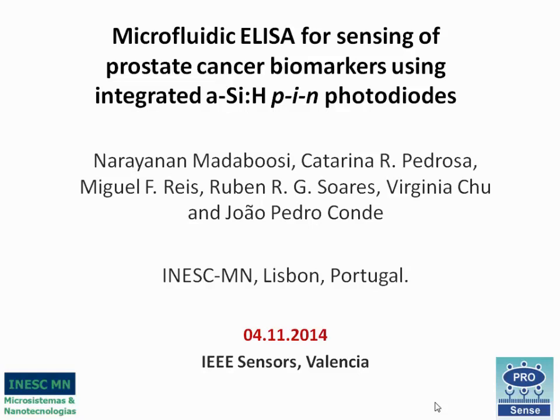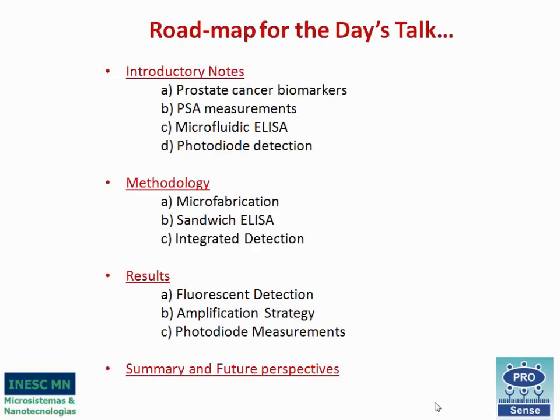I am Narayanan from INESC-MN Portugal, and I am glad to present the paper on microfluidic ELISA for sensing prostate cancer biomarkers using integrated amorphous silicon photodiodes. Today I will guide you through some introductory notes on prostate cancer and biomarkers specific to prostate cancer, with special reference to PSA, and then talk about the microfluidic ELISA strategy that we are employing to read the PSA measurements, and the photodiode as a detection mode.